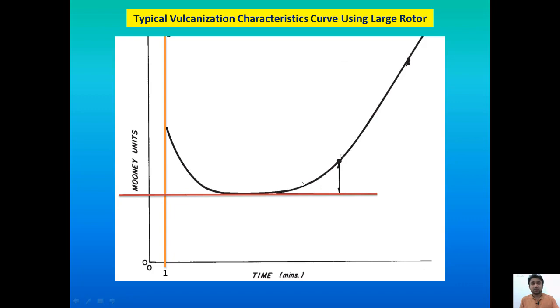Again, the rotor will feel now the material is getting hardened and hardened, and the rotor will feel it requires high torque, and higher torque, to keep its 2 rpm rotational speed, right? That's why this curve goes in this way. Okay, now we will receive this curve due to that principle.